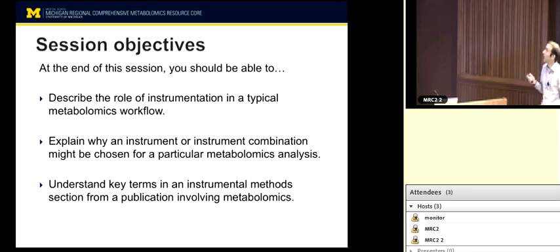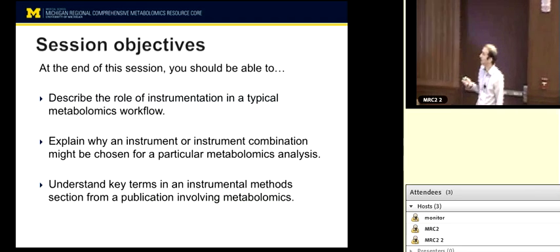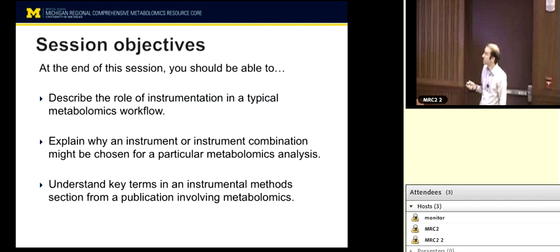All right, so outline. First, we'll talk about the tools that you would need for metabolomics. We'll briefly mention NMR versus mass spectrometry, but most of this talk is going to focus on mass spectrometry. Kathleen Stringer, who's going right after me, will tell you more about NMR and how that's useful in metabolomics and why it's a very complementary technique.